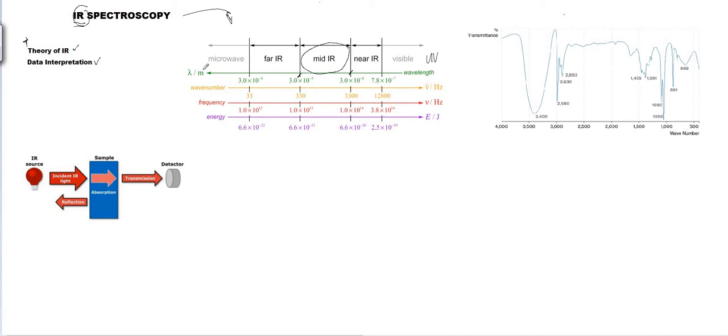So in terms of the wavelength, of course, infrared has a longer wavelength as compared to the UVVis, and also lower frequency as compared to the UVVis. Okay, so that's why we have frequency here, and then try to relate with the energy and wavelength. Another one here, you know that this is wave number. So why I have to make sure that you understand the wave number. Basically, wave number is 1 over lambda, yang mana dia akan more focus towards the unit centimeter^-1.